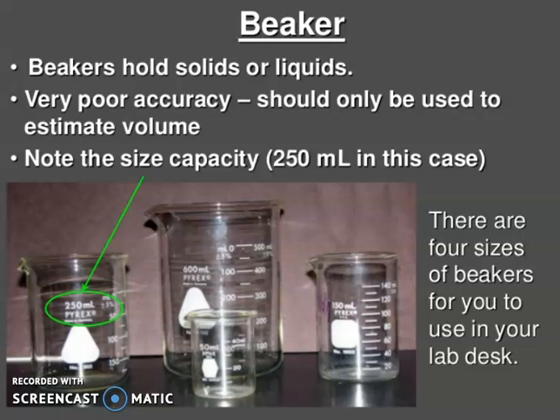Today in this video, I am going to show you laboratory equipment, their names and use. You can see here the beaker. Beaker holds solid or liquids.